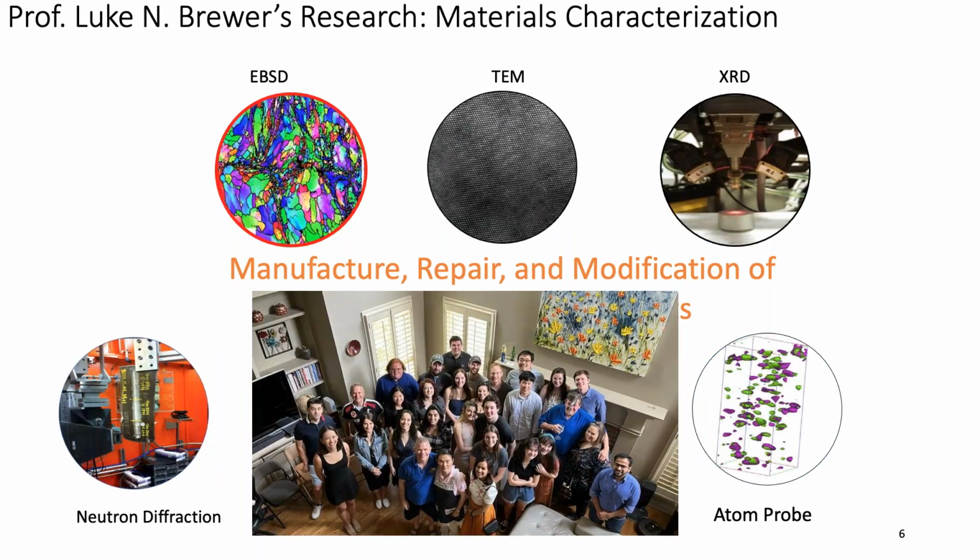I have a deep and abiding interest in materials characterization. I mean, you can't make new things and not look at them very closely to see, well, how did they change? And so I've had the opportunity to work with a number of characterization techniques over the years, including electron microscopies, both at the micro and nano scale. I've also used quite a bit of X-ray and neutron diffraction. We'll talk some more about that later today. And more recently, I've gotten involved in atom probe tomography.